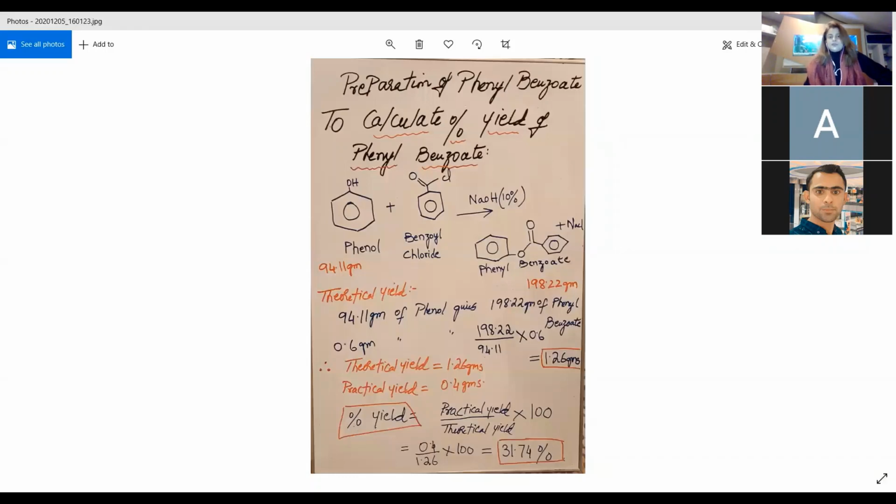It's the 14th step. So after that step, when you got the precipitates, in the previous slide, you were left with these red colored precipitates. I mean, the precipitates are white, but my handwriting is in red color. And then you are going to use hot ethanol, right? You will add hot ethanol because now you have the crude product, you can also call it the raw product. Now you need to recrystallize it.